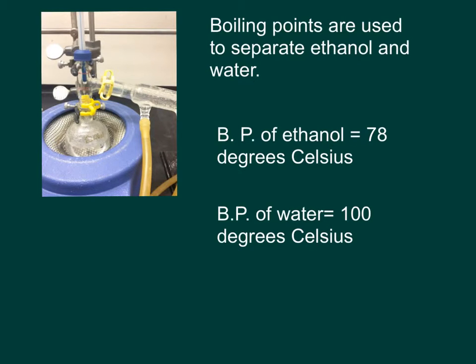Water is constantly evaporating, but it's not always at its boiling point. Therefore, while ethanol travels up the distillation head and into the water-jacketed condenser, the ethanol begins to condense and can be collected as a distillate, whereas the water starts condensing as it reaches up the flask, and it starts to drip down, as is visible in the image above.